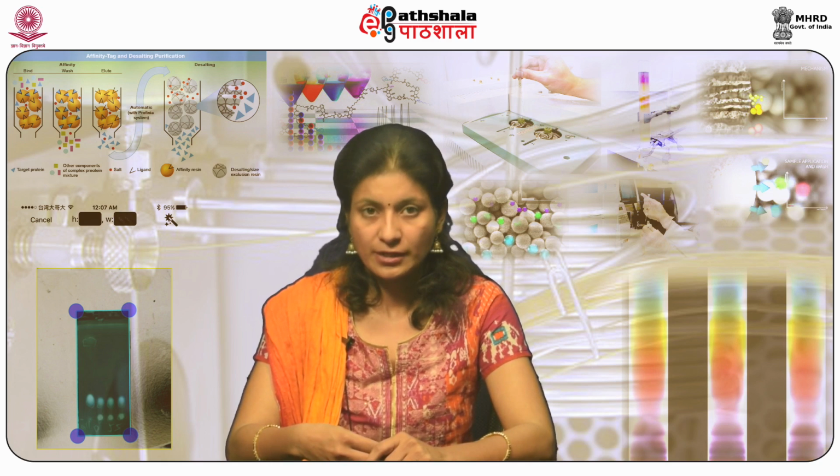Identification of unknown organic compounds in hazardous waste dumps, analysis of industrial products as well as identification of reaction products, pollution studies, and other kinds of environmental analysis.